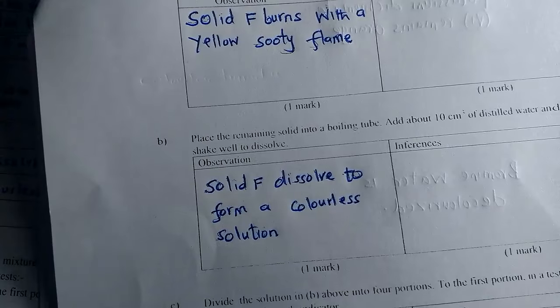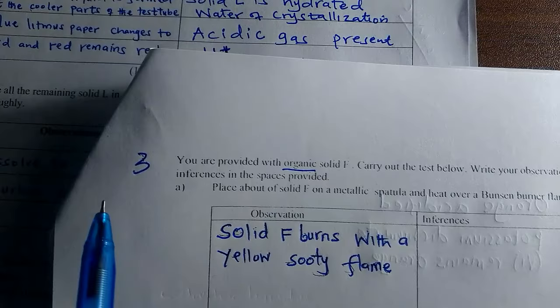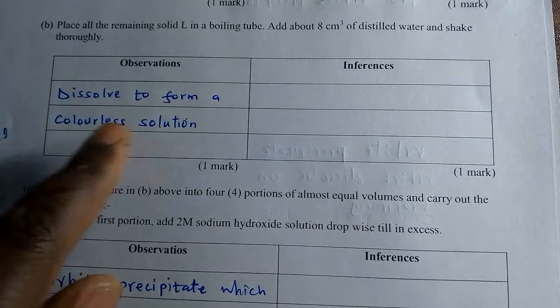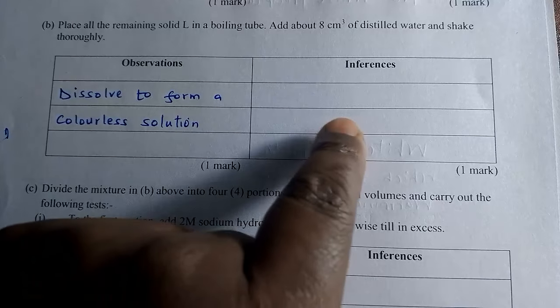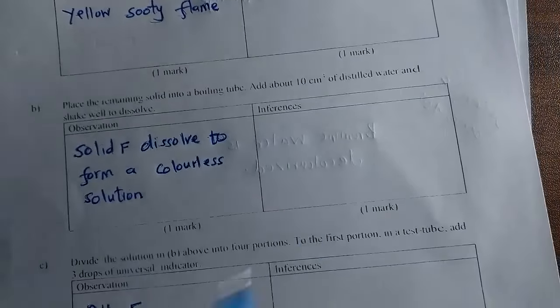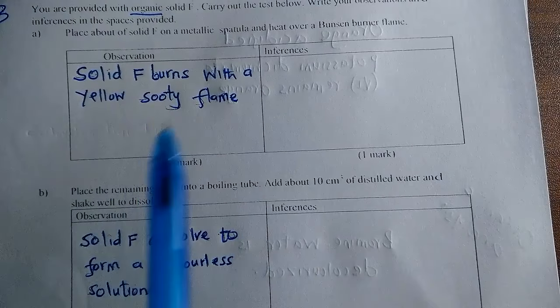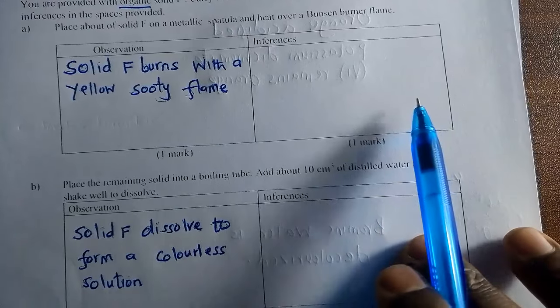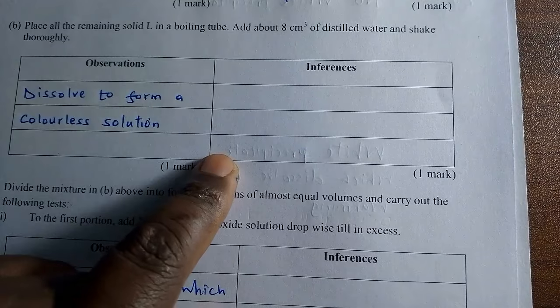In both, solid F would dissolve to form a colorless solution. Question 2, the solid dissolves to form a colorless solution. So some people think, what are you going to write here? And what are you going to write here? For organic, we would say it is polar. Organic compound, it is polar. But for this one, it is different. So I hope the difference is now clear.